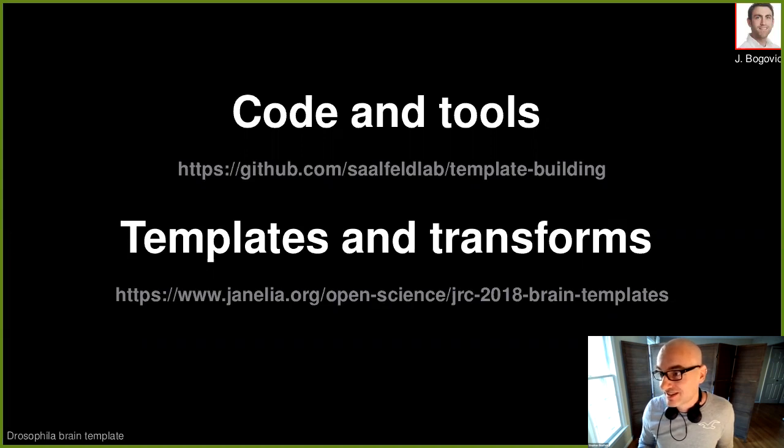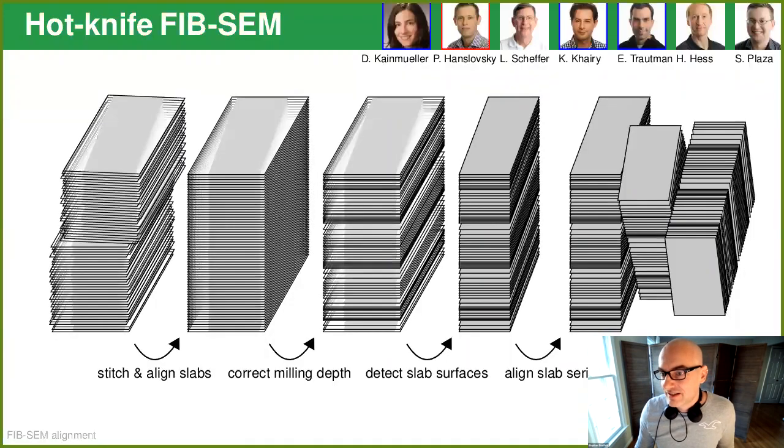Okay, so a different project that we've been busy with that is also not well described because it's only in the supplementary material of the big hemibrain paper is how we registered and aligned together with many fabulous colleagues the hemibrain dataset. So I showed you the video earlier in the talk that this consists of these independent 13 slabs, and there are new incoming datasets with even more, of 20 micrometer thickness, and each of them is imaged ideally on different FIB-SEM microscopes. And so you have a whole series of things. I'm skipping the more trivial parts here to reassemble them into a joint volume.